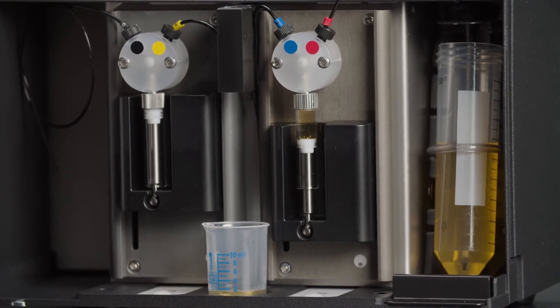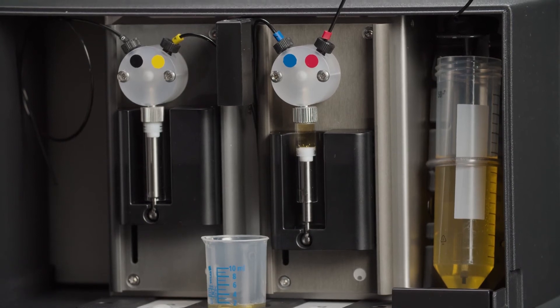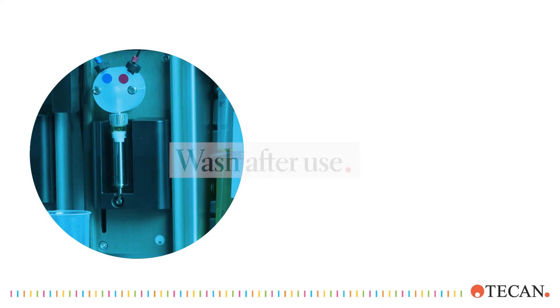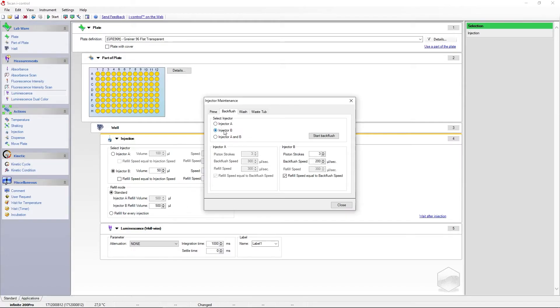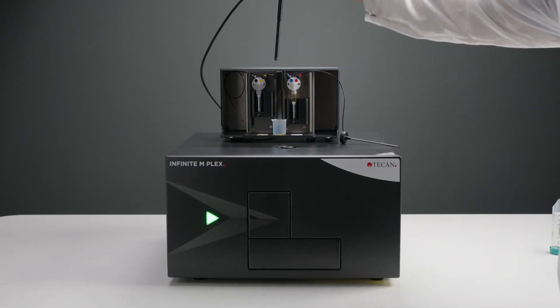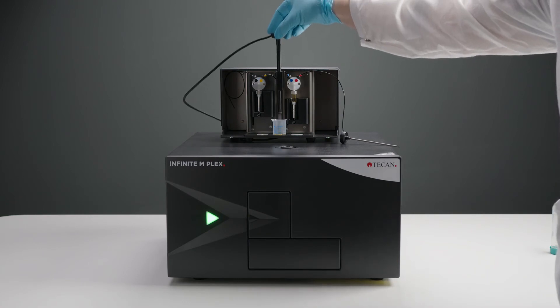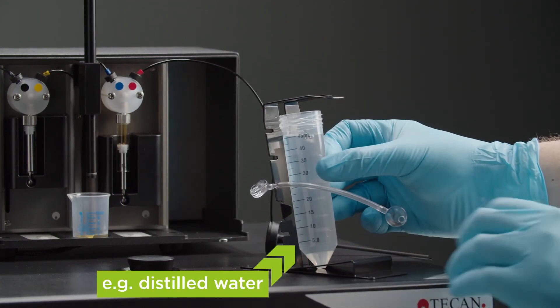During the measurement, the injector module will inject the liquid as defined in your method. Use the back flush function to save valuable reagents. To wash your instrument after use, bring the injector carrier into the service position again. Put the tube in a rinsing solution to flush the system for cleaning.